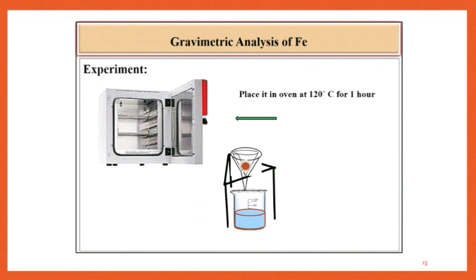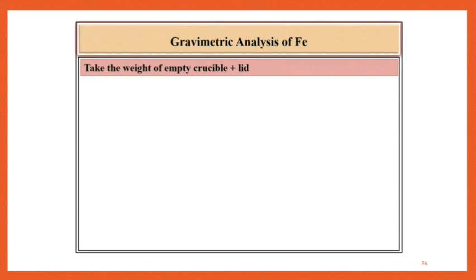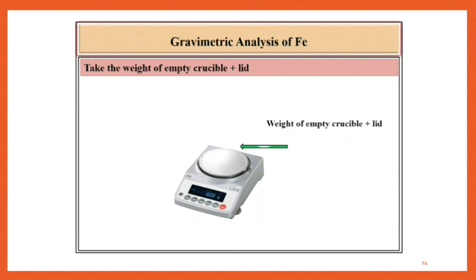Allow the water to drain out completely and dry the precipitate on a metallic cone or in an oven at 120 degree centigrade for 1 hour. Meanwhile, take the weight of empty crucible plus lid and record this reading as W1 gram.